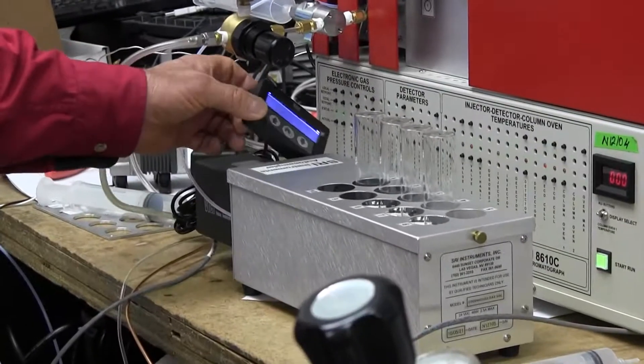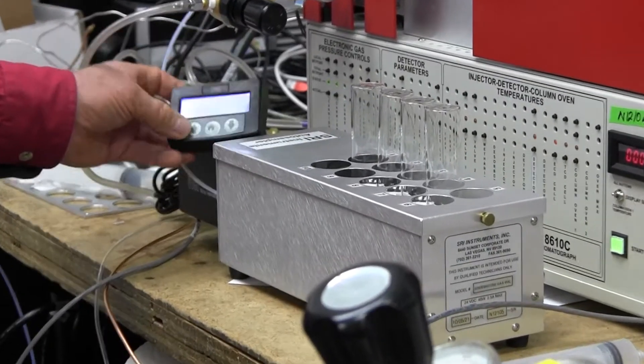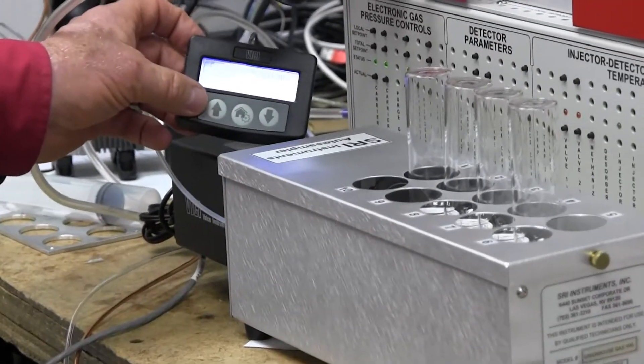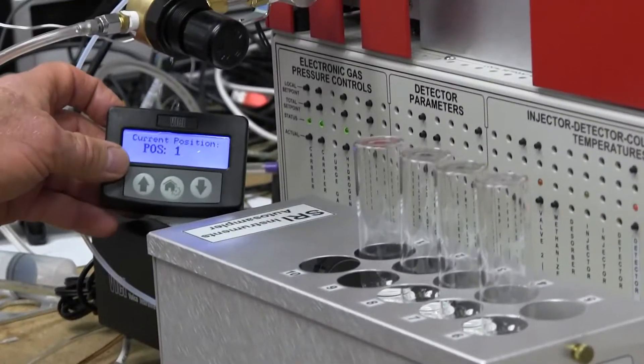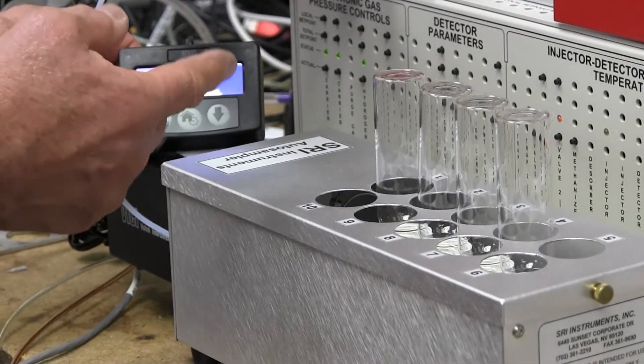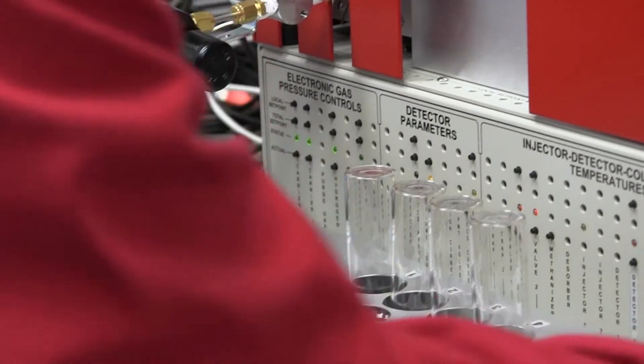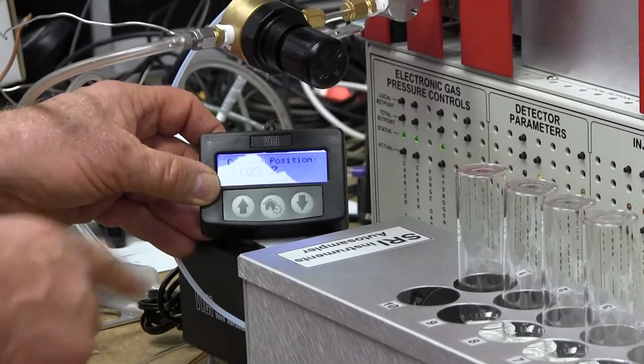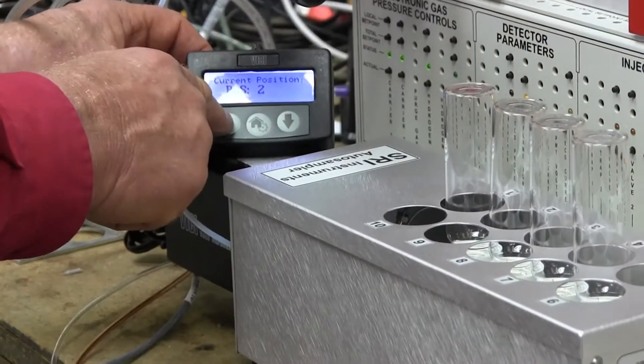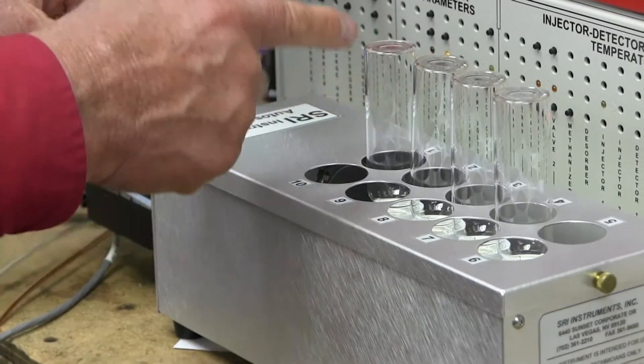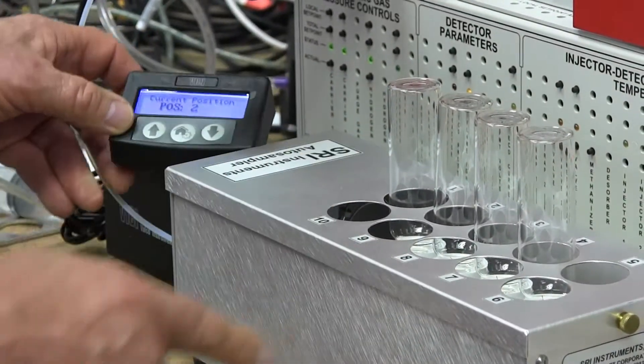I think we even have a video that shows how to do that. But now to control the position of this auto sampler, here's this little control box that shows the position. So right now it's showing position number one. And there's really only two things that can happen. A contact can close and make the position index by one. So by pushing this, I made it go from position number one to position number two.